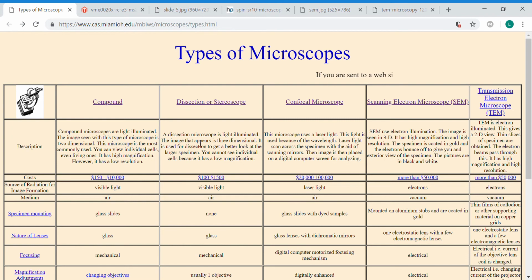But in contrast, compound microscope, dissecting microscope, and confocal microscope may not produce the best resolution and magnification, but the price is relatively cheap and rather easy to use. In terms of practicality, people usually will use these three microscopes to observe the sample. Then, if it requires a better image, they will simply send it to the microscope lab to do the observation with electron microscope.